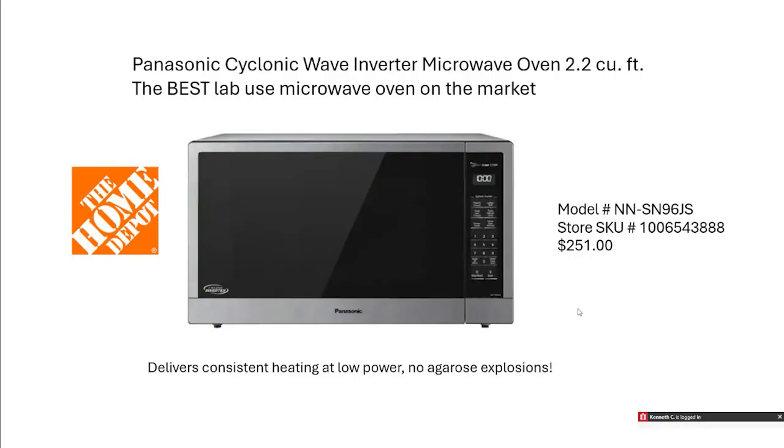So it's very important. Usually when I boil, I bring the agarose to a vigorous boil for a minute, or for seconds, and then let it cool a little bit, let the bubbles die down, and then boil it again, and do that about 5 times to make sure your agarose is completely dissolved. And then you'll have a nice homogeneous agar to deliver into your inflation of the lung.